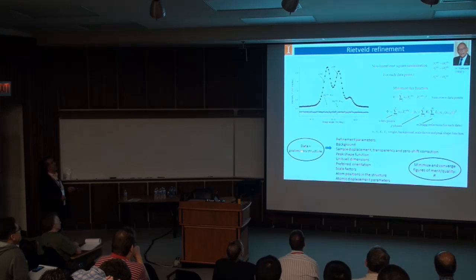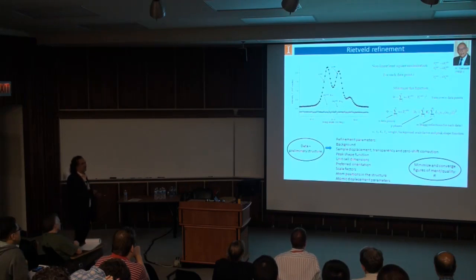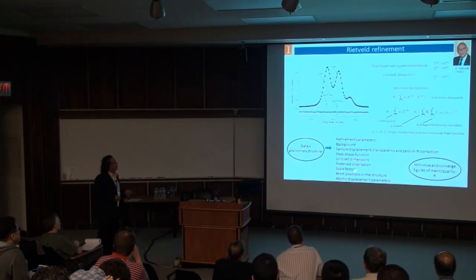Basically, you get your data, and you have to know a little bit about the structure. And you crank the software, and you refine everything: background, sample displacement, peak shape, all the things you can imagine. You refine, and then you get a lot of information.